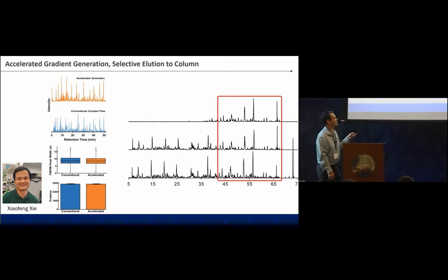Okay. Yeah. And then I have another question, which is a little bit more open-ended. You have been at the leading edge of developing the low flow approaches that increase sample delivery to the instruments. And we all appreciate their benefits, and your work beautifully illustrates that. But of course, there's also the pain of getting them to work. And what is your vision in the future? Let's say at this meeting or the International Single Cell Mass Spectrometry Conference, 2, 3, 5, 6 years down the road, do you imagine us all talking about those methods and using them in a more painless way?